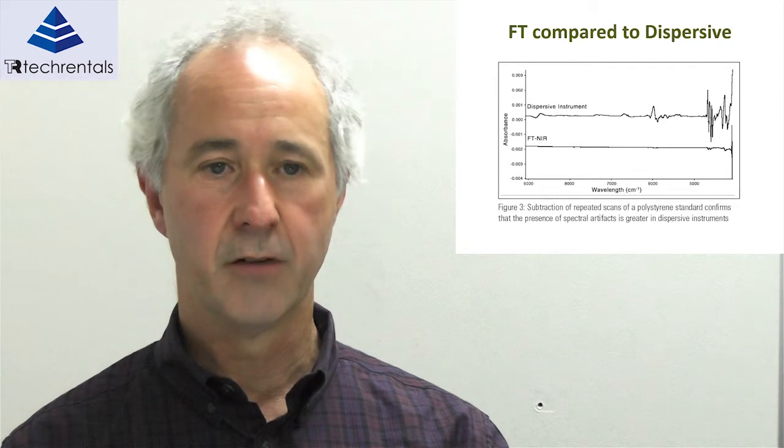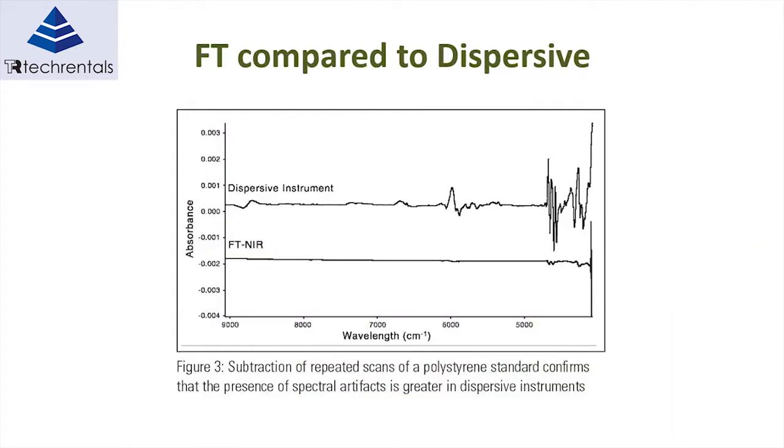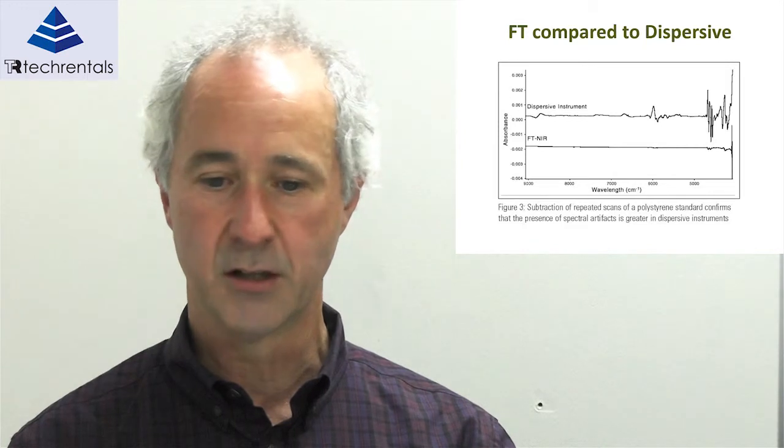Here's a comparison of an FT-NIR device versus a dispersive device. They've repeatedly taken samples against the same object — a standard polystyrene reflecting the source light. For the dispersive instrument, there's a certain spectral signature which is not reflective of the standard at all. If you continually measure the same signal and measure the deviation from the mean, in a perfect world you should get a straight line — and that's certainly not the case with the dispersive instrument. The FT-NIR is considerably better, though at longer wavelengths you do start to see a little bit of a signature.